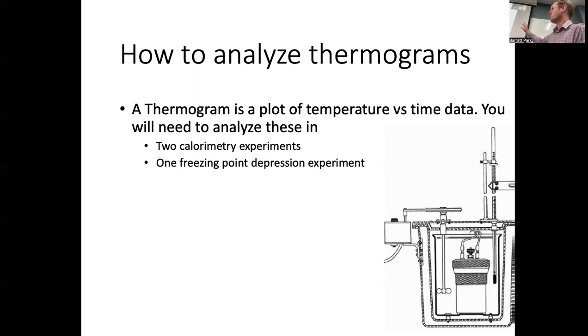But one of the topics that you'll be doing two different labs on this semester involves calorimetry. And so I'm just going to take you through an example of how to analyze the thermograms that you're going to get when you do calorimetry. Okay, because in the past there's been a lot of confusion and questions about this. So I just wanted to include this in the lecture.